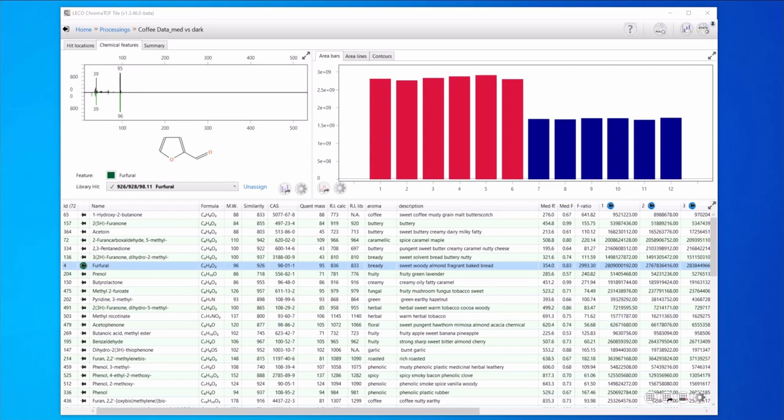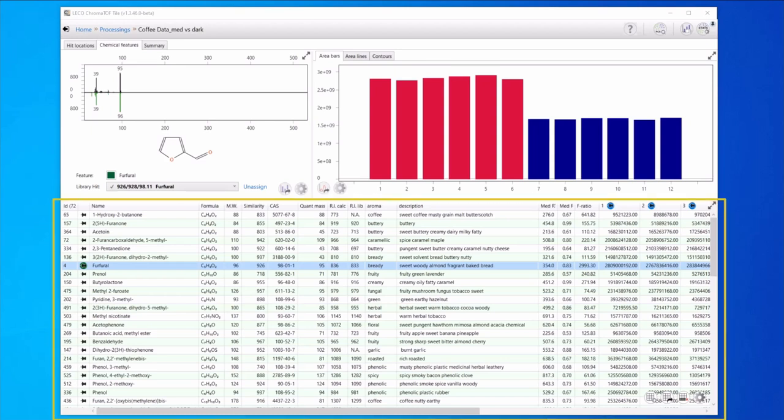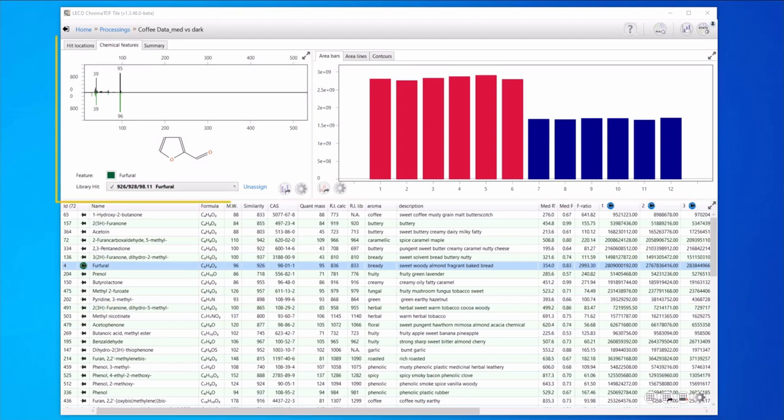After processing with these options, ChromaTOF Tile compiles information in this chemical features table. Here we have a focus list of some of the analytes that differ between the medium and dark roast samples. In the table across the bottom we have analyte names with similarity score, retention index information, and other identification metrics. In the top corner we have the observed spectral information and the library match.